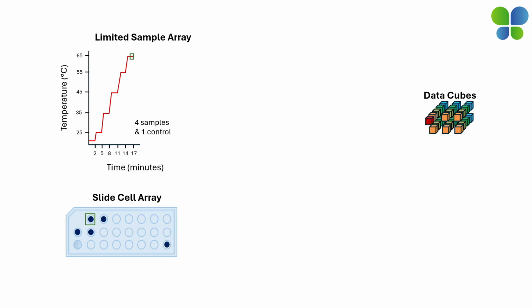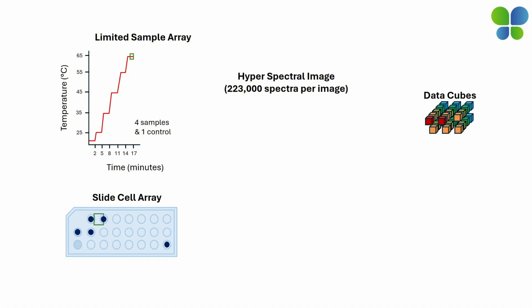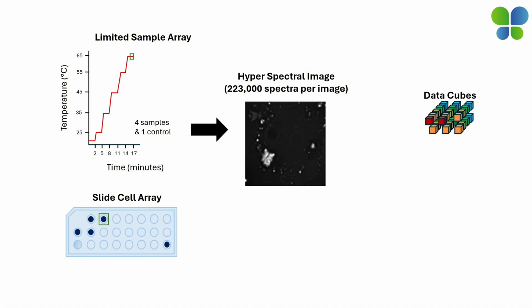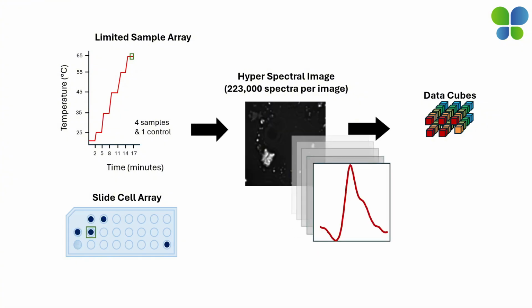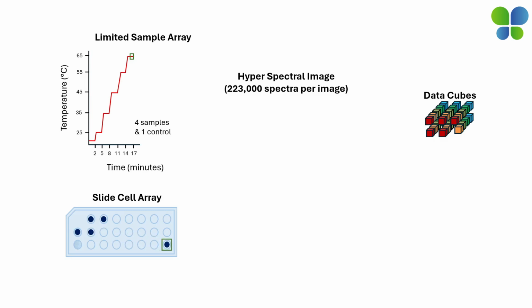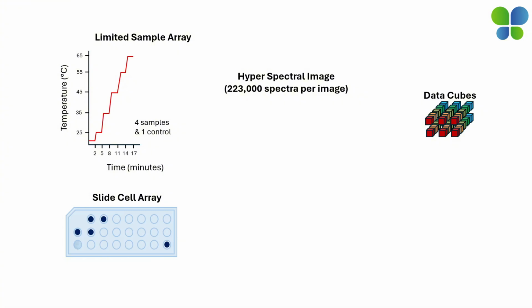The hyperspectral image is stored and can be re-examined at a later time for the investigation of deviations in manufacturing, to establish control strategies, or simply available for further investigations. The robustness of the method is ensured through its automation using our centralized data management system, with architecture designed to be 21 CFR Part 11 compliant and ensure data integrity.